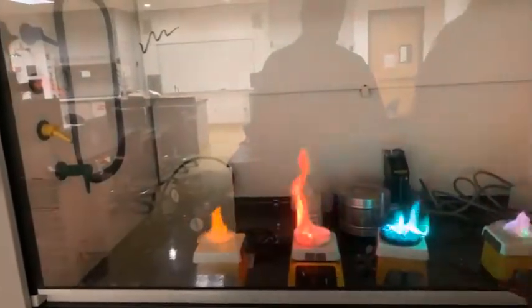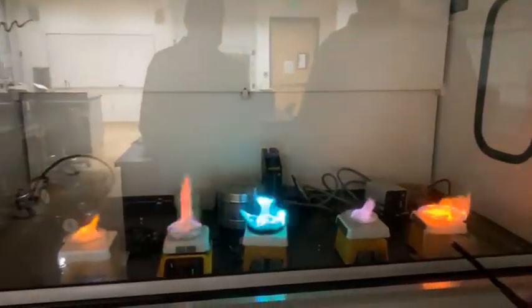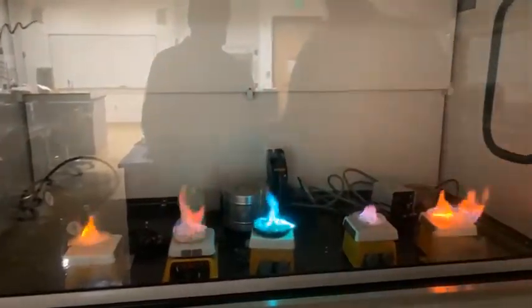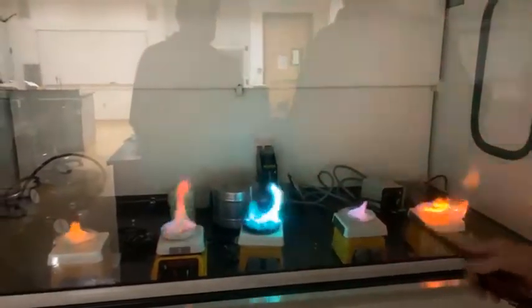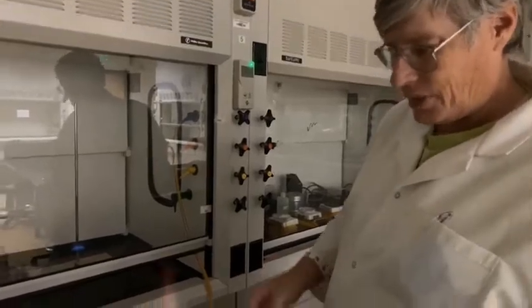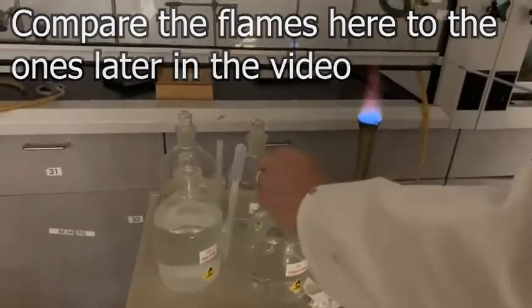So in our unknown, we're going to do a brief flash to see if we can see evidence of either calcium, potassium, or sodium. Barium does a bright, ghostly yellow-green color, and I do not have a barium flame here. We are now going to demonstrate the known flames of our four cations that have a flame: potassium, barium, calcium, and sodium, and we're going to do it in that order.